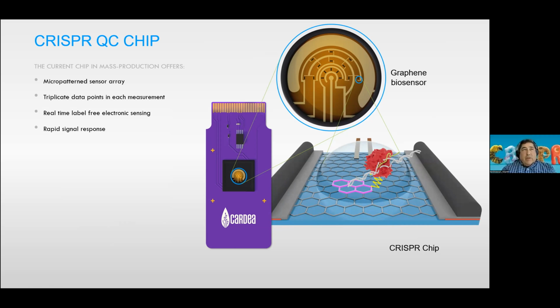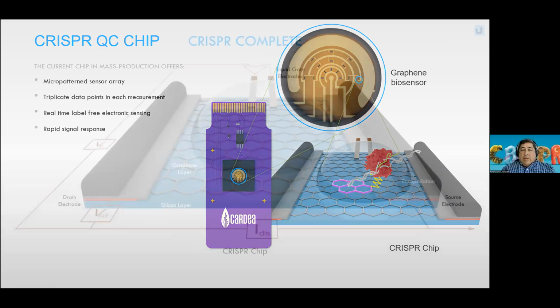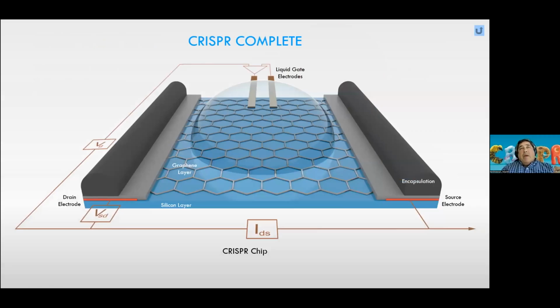And I'm going to show you how we make one of those chips, because I think that question came up. I wrote a note down and someone asked, how do you actually functionalize? And I think Francie answered that really nicely in that I think someone said there's some pixie dust or magic, and there actually isn't. As much as I would like to say there is, it's pretty straightforward, as Francie explained, for functionalizing a ligand of interest. And I'm going to take you through how we create a CRISPR chip.